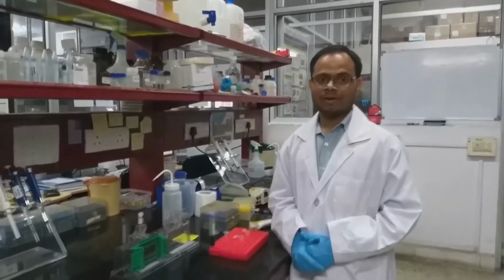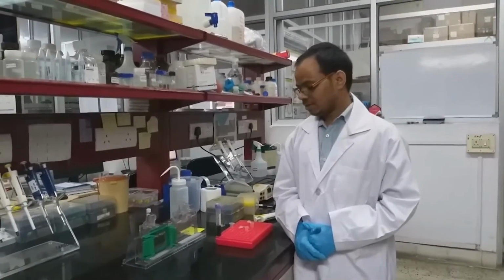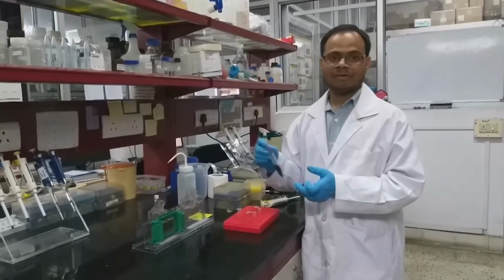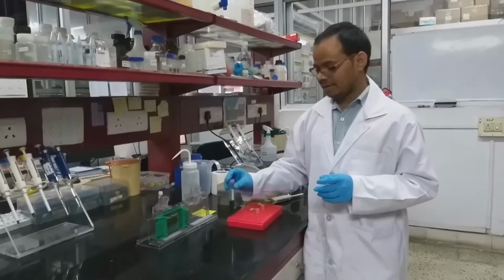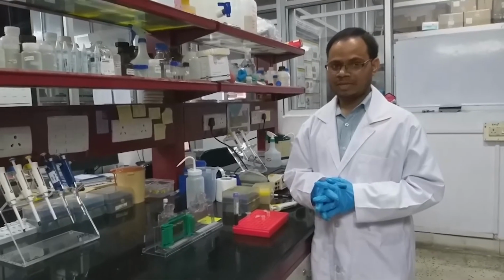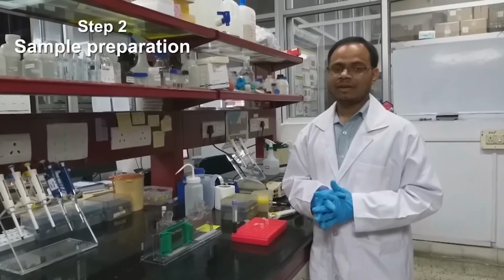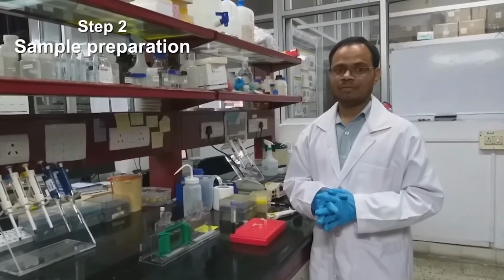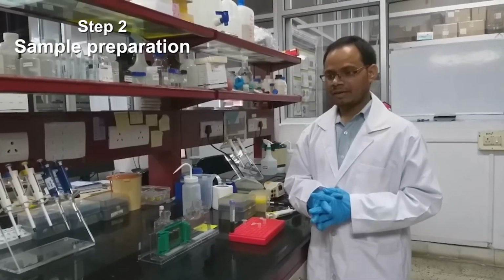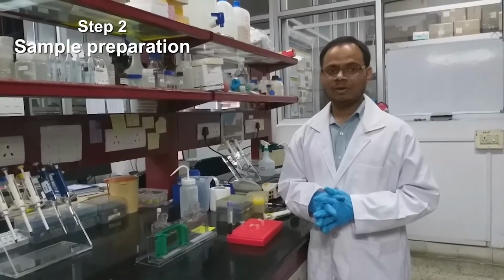sample for loading in SDS-PAGE. So for that we have to prepare loading dye, 10x or 6x loading dye. It mainly contains 250 millimolar Tris pH 6.8, 30% glycerol, 10% SDS and 0.05% of bromophenol blue. So here we can add 10 millimolar of DTT also as a reducing agent.